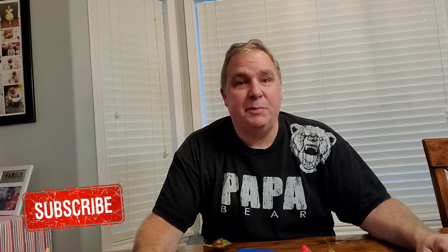Welcome, I'm Harold with Papa Bear's Peppers and today I want to talk to you about a new pH meter. I know a lot of us talk about pH and wonder if our pH meter is accurate. Do I have to do the three-point calibration? I've gotten a lot of feedback from my previous video on calibrating your pH meter with the three-point method. Well, recently I saw one and I had to get it, and I'll tell you why.